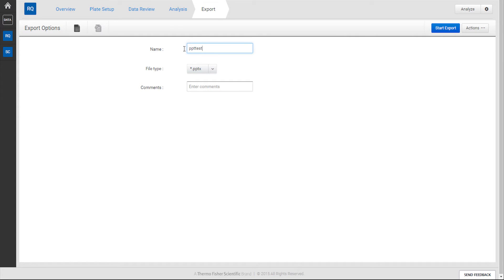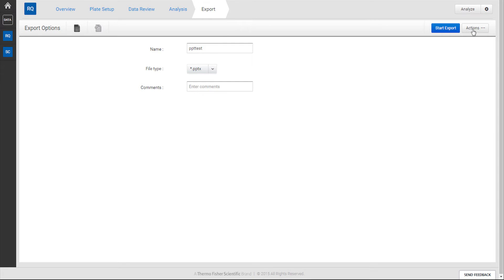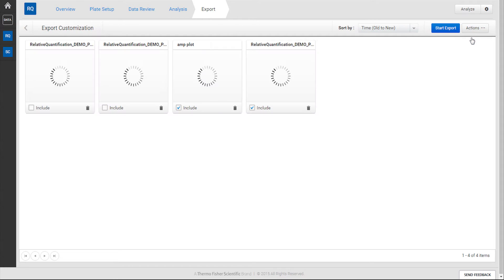Type in a desired file name and change the file type to PPTX. Then go to the Actions menu in the corner and click on Customize.